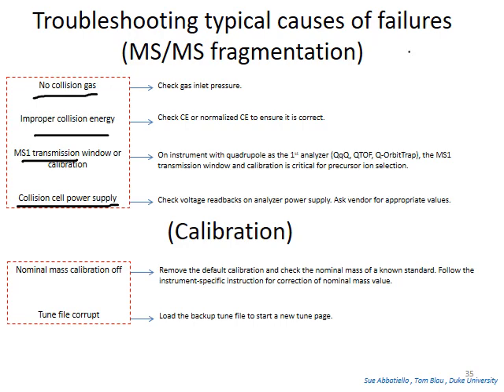Calibration. If calibration is not done properly, it will affect the selection of precursor ions. So at times you need to manually check by introducing a known standard.